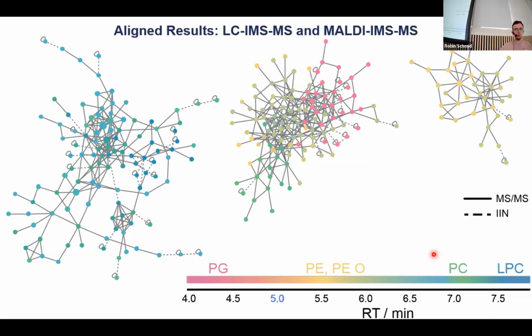Yeah, so we also support IMS from mzML files. It's, I would say, it works. It's not as straightforward as with the timsTOF files, but we also have a wizard for that. So basically, if you drag and drop your files, now I need to exit. Yeah, and I need to share the correct screen again.